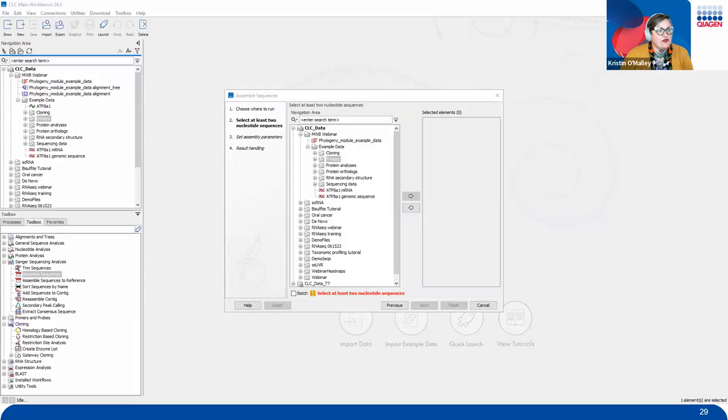Okay, sounds great. So we do have quite a bit of ground to cover today. So we may be spilling over from our 2:30 mark, so I apologize for that. But if you have to leave, if you have a meeting right up against this, feel free to leave. And we are recording this session, so you're not going to miss anything if you wanted to review that other information that we might spill over into. So let's get right into it to not waste any more time.